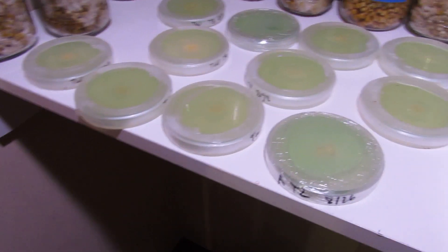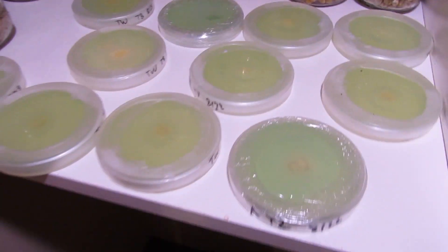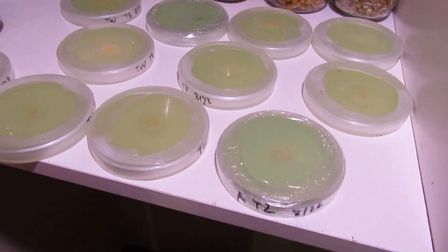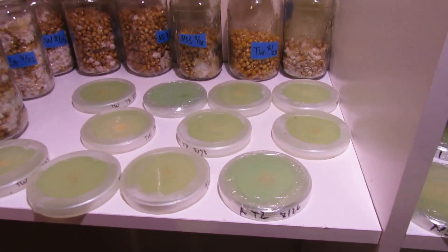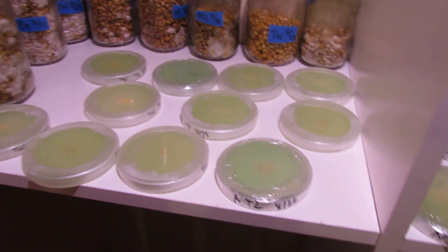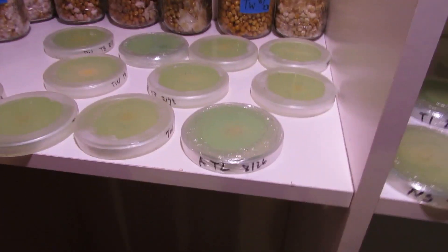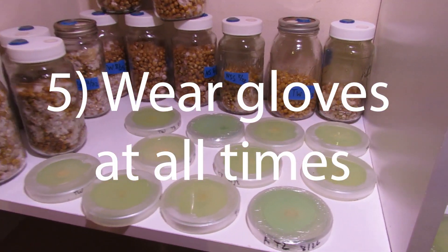Number four: you really want to be quick when you're working in front of your flow hood. Work as if you were working in open air — open that plate, get your tissue on it, close it back up, wrap it quick. Be as fast as you can. If you fiddle-fart around in front of the flow hood, that's when your plates are going to get contamination.